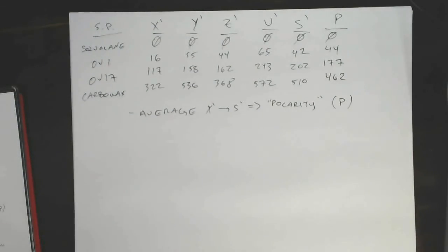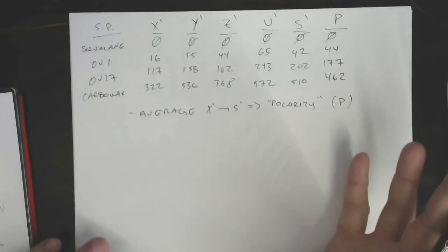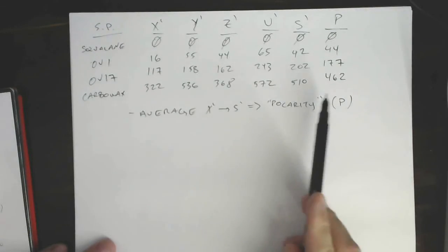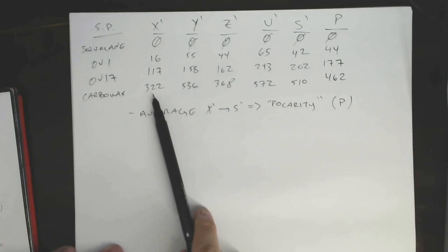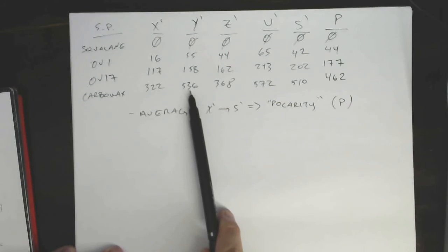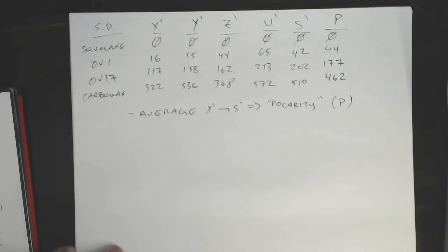The thing with P is that it's a nice qualitative way of just one number that compares stationary phases, but in my opinion, and I think in a lot of other folks' opinions, the individual numbers are a lot more useful because they're modeling different things, and averaging them together doesn't tell you the whole story, right? So this was its ability to induce a dipole. It's clearly much less than its ability to accept hydrogen bonding, which I think was what our Y prime was. And so this is kind of a simple rule of thumb polarity comparison.